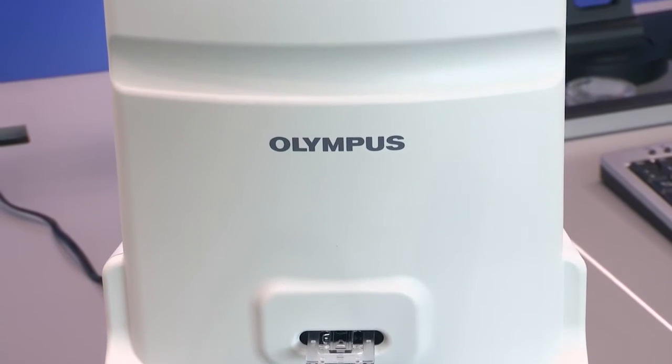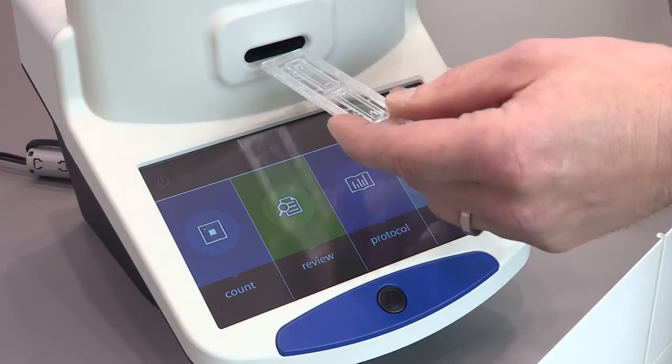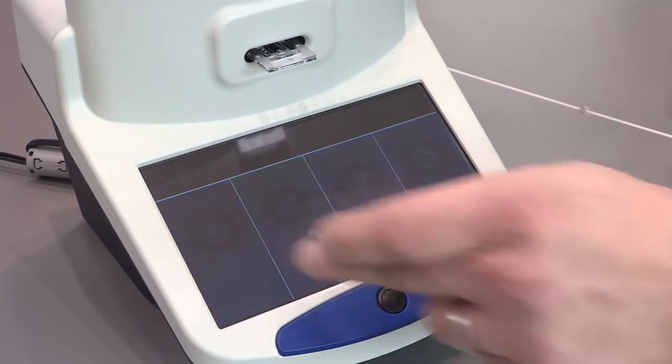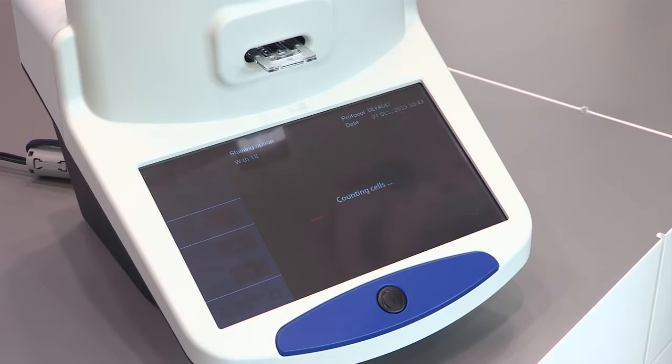What you do is you use this cell chamber — you put your cell suspension into this chamber and you put it into this cell counter. Then you simply press count, and the system will take a complete analysis of your cell culture.